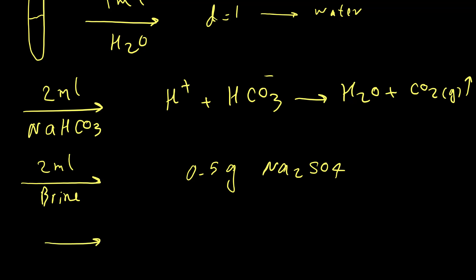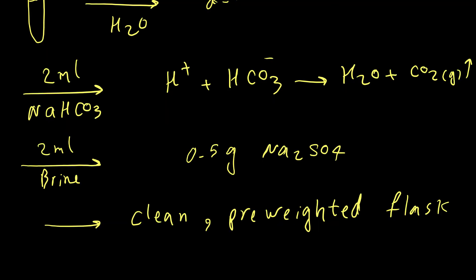After adding 0.5 grams of sodium sulfate, give it time for 5 minutes. Then we are going to slowly remove our product and transfer it to a clean and pre-weighed flask. Then we can calculate the mass of the product.